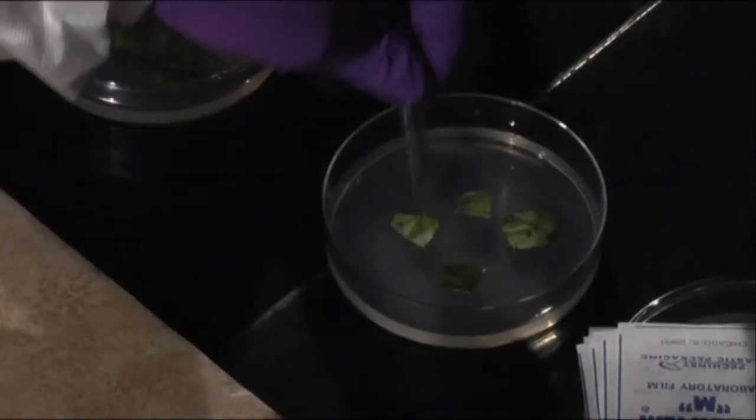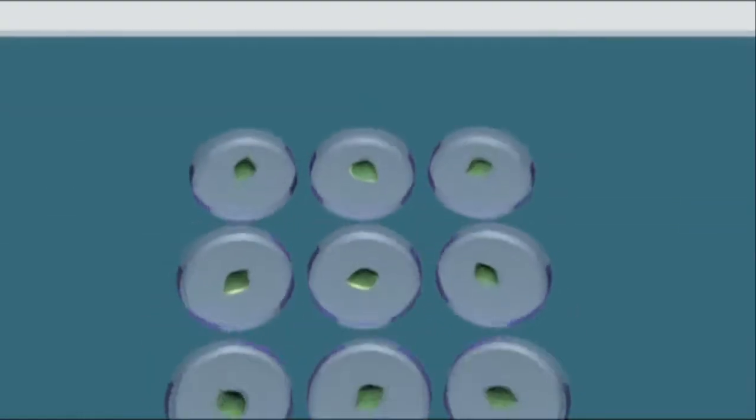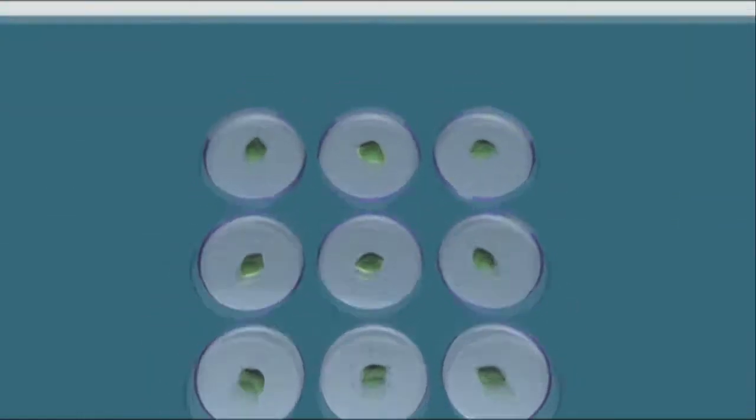Each plate will have one of three types of media that, depending on its combination of auxins and cytokinins, will produce different effects.